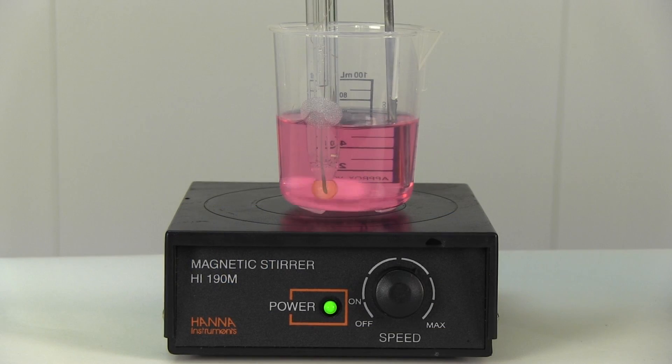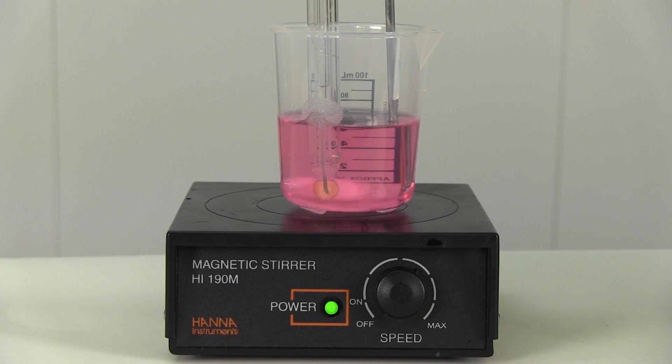Next, we need to determine the slope of the pH electrode. In order to calculate slope, you need two values, so we need to take a second millivolt reading using a second different buffer.